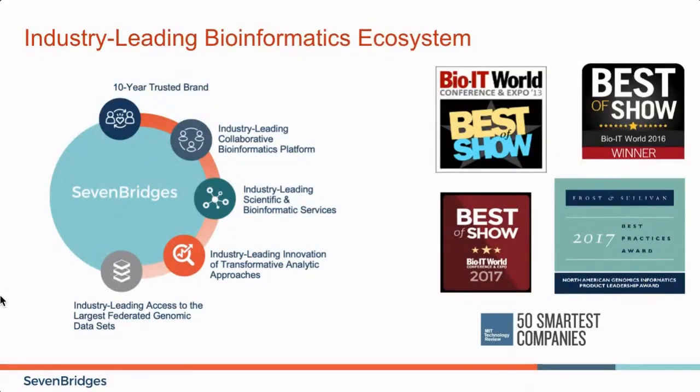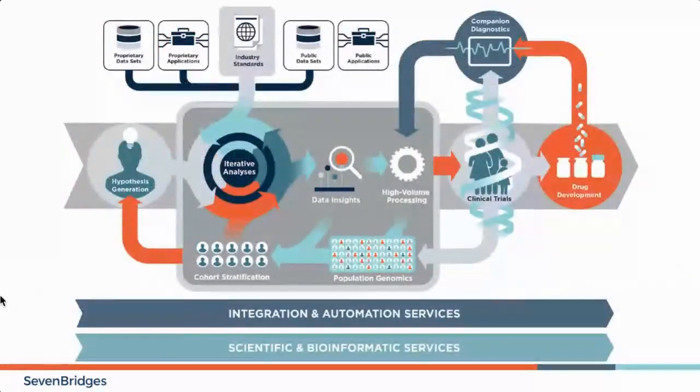And this depth and breadth of experience with many different types of bioinformatic analyses has been worked into our platform over the years, and we've been awarded a number of awards for how easy our platforms make it to do these types of analyses. And the way we do this is sort of shown in this diagram here.